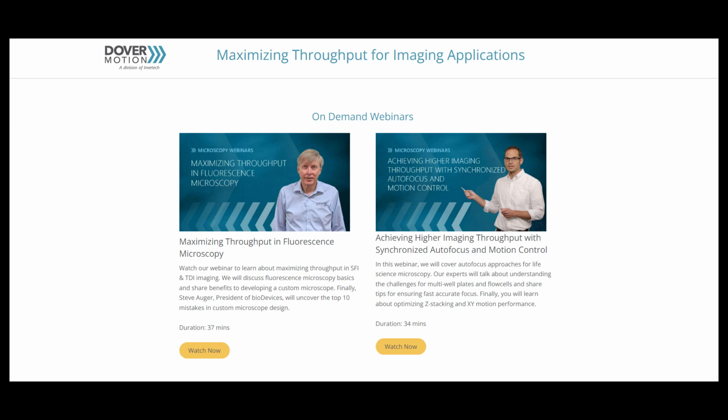We've also got a webinar that we did jointly with WDI Wise Devices that talks about how to use a hardware laser autofocus system in order to maximize focusing throughput. With a laser autofocus, every time you move to a different area, you do not need time-consuming software contrast-based algorithms processing multiple images at different Z heights to determine the focus plane. Instead, the laser autofocus hardware will directly command the Z objective motion axis to be within the depth of field to ensure clear images.